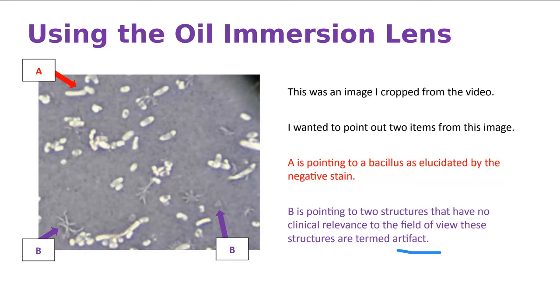The one that's the red arrow, that is important. That's the bacterium itself, right? But other things that are important that you might not appreciate just yet is that there are some inclusions here. There's an inclusion there, there's an inclusion there. So there are some inclusions in these bacteria. Some of them might be spores, it could be other things, right? And we're going to be looking at some of those inclusions as we get further on into the course.